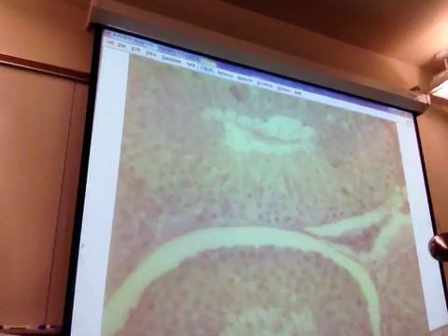What was the term called? The luminal compartment. Luminal as in towards the lumen, versus the basal, towards the basal layer, because remember that the nurse cells are polarized. Is that where the blood-testis barrier is? The luminal is above, towards the lumen, and the basal is below. And if you had a good cut, you'd be able to see an actual distinct layer.